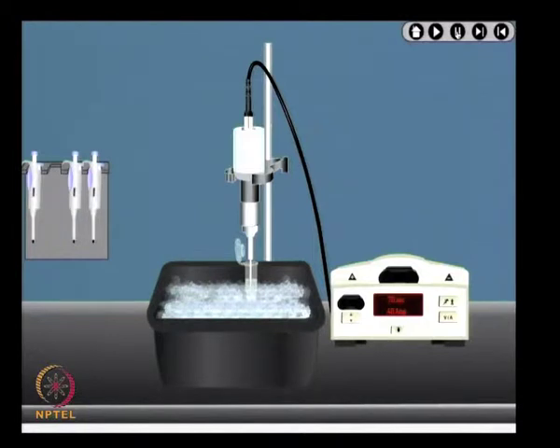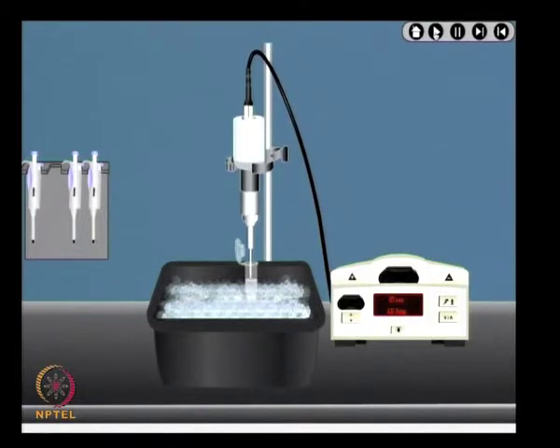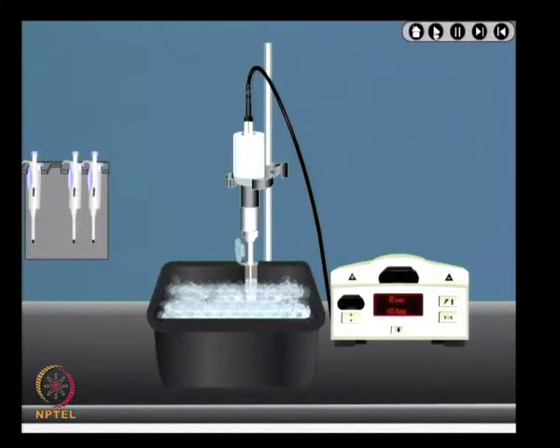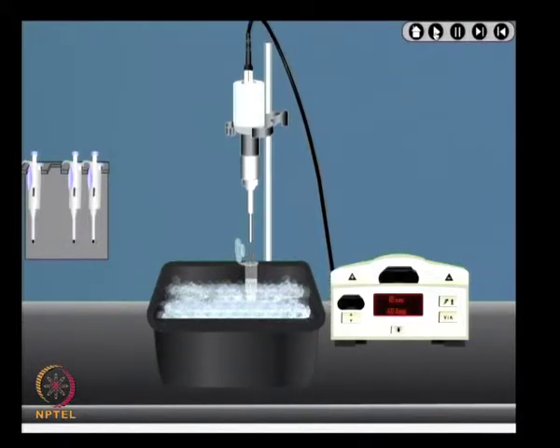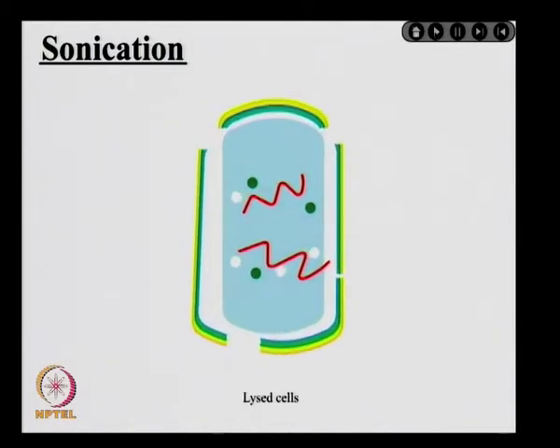The sonication step helps to release the content of bacterial cells. Sonication can be performed by using a sonicator for 6 cycles of 5-second pulse with 30-second gap in between at 20% amplitude.